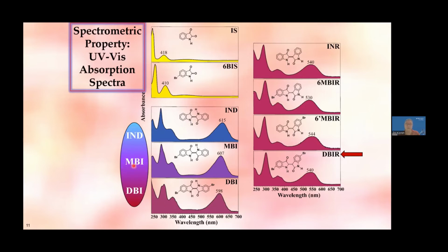Interestingly, monobromo indigo is like an in-between color. It's a separate component. It's not a mixture of indigo and dibromo indigo, but in looks, in appearance, it's a violet kind of color, as you see here. But also in archaeological samples, besides these three indigoids, dibromo indirubin also stars in it. Usually it's not a big component, but of the other trace components, it's usually significant in there.